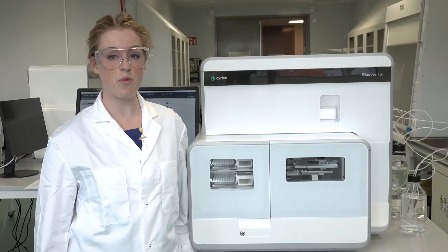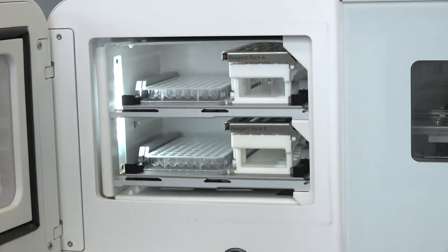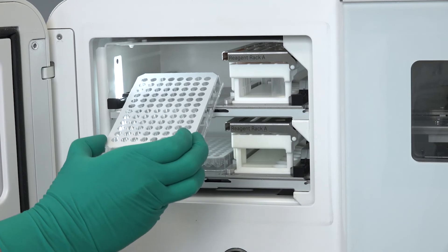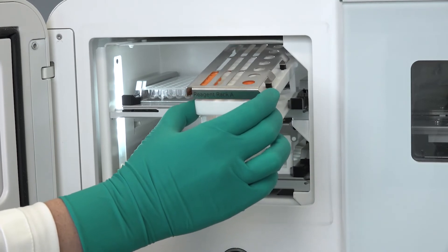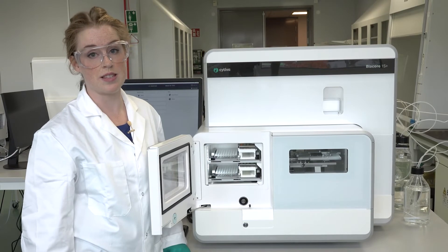In this system, samples and reagents are placed on a tray, either in a microplate like this one, or in vials in a reagent rack. We have it here. And in Biocore 1S+, there's room for two microplates and two reagent racks in the sample hotel.